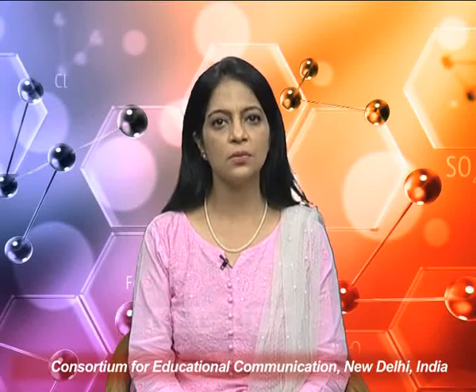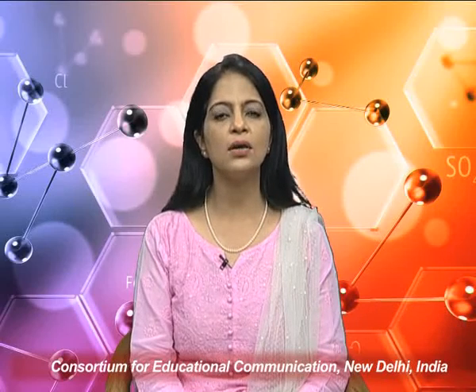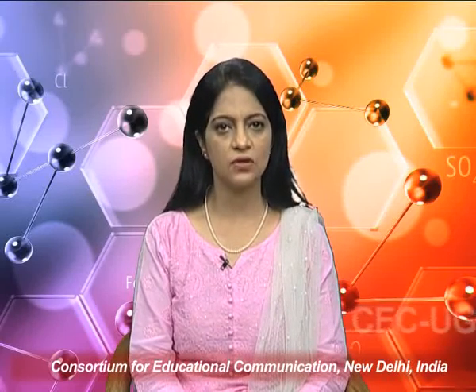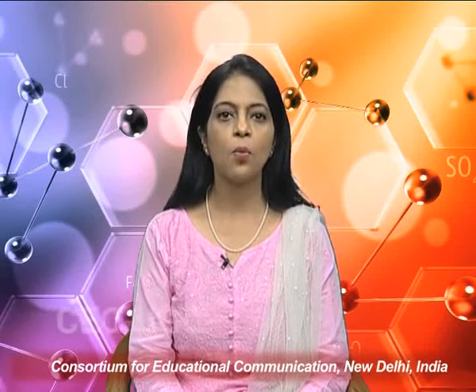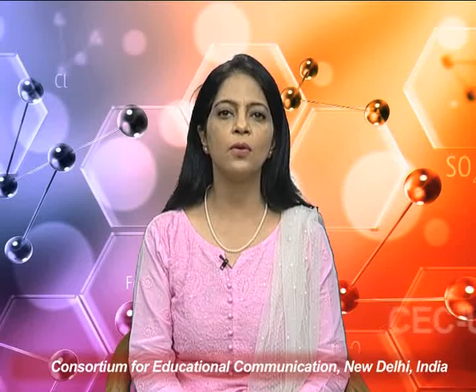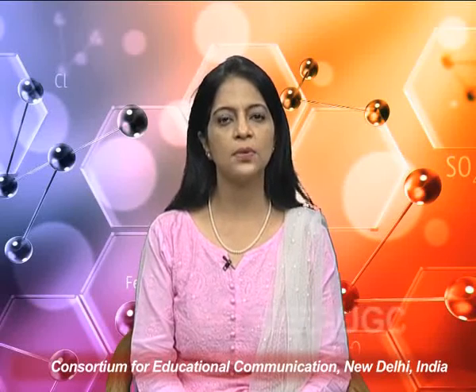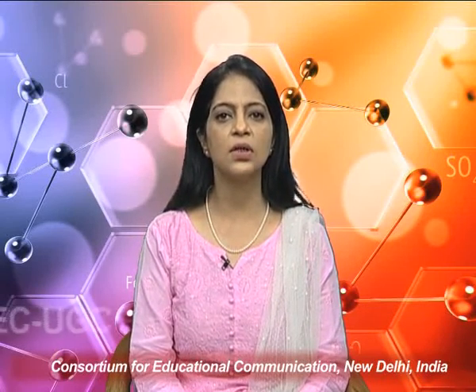The red color, as we all know, is due to the formation of the metal indicator complex, and the blue color is due to the release of the free indicator after the metal ions have been exhausted and have formed a complex with EDTA. 1 ml of 0.01 molar EDTA will be equal to 0.4 milligram calcium, and by a series of calculations we can determine how much calcium is present in a given sample, whether it is a water sample or a given solution.